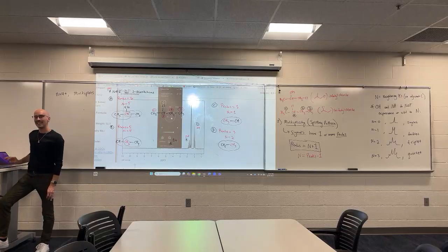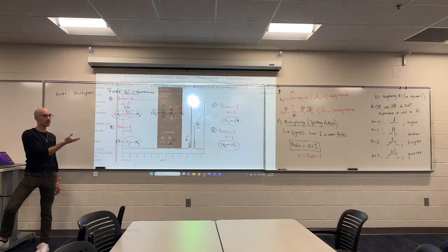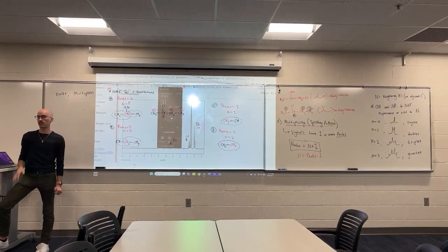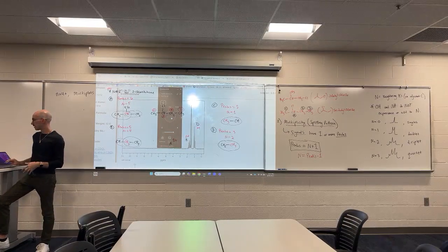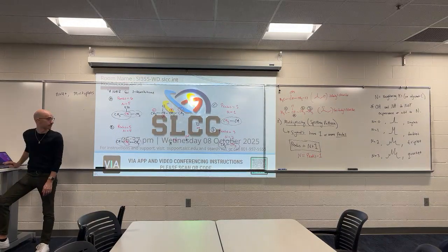NMR is an incredibly powerful tool. We literally just built a molecule based on interpreting the signals from NMR. The chemical shift, the integration, the splitting pattern, all tie in with each other. So I want to give you guys an opportunity to practice this.